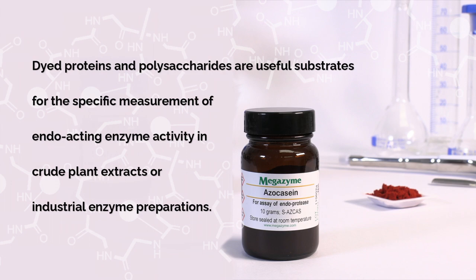Dyed proteins and polysaccharides are useful substrates for the specific measurement of endo-acting enzyme activity in crude plant extracts or industrial enzyme preparations.